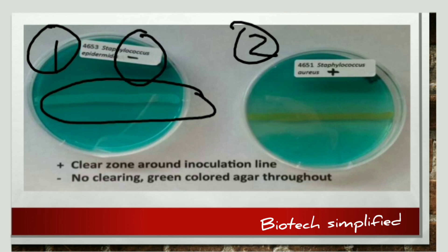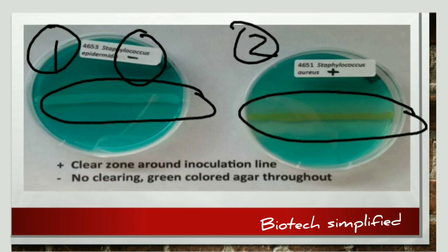In the second petri dish, Staphylococcus aureus is capable of hydrolyzing DNA. A clear colorless zone is visible around the colony, indicating that Staphylococcus aureus is positive in the DNase test.